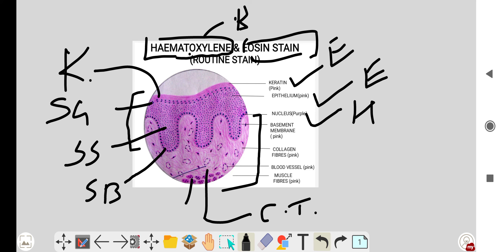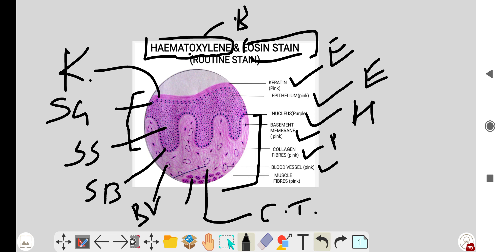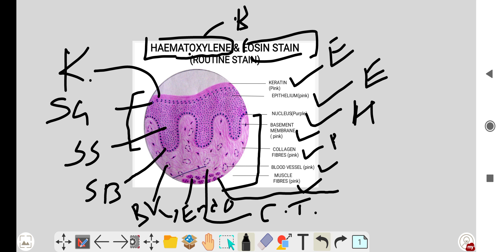The nuclei stain dark purple with hematoxylin. The basement membrane, which separates the epithelium from the connective tissue, is also pink. Collagen is pink, blood vessels are pink, but the nuclei of the endothelial cells are dark purple or dark blue. Muscles are also pink, but muscle nuclei are dark purple.